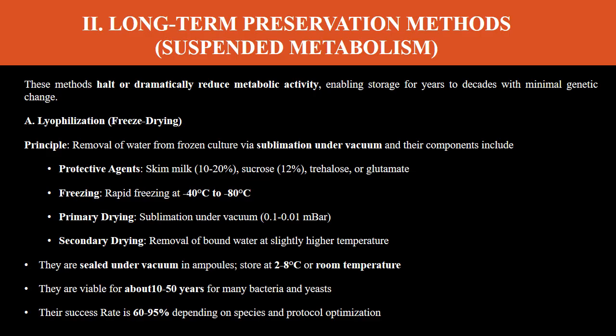They are sealed under vacuum in ampoules and stored at 2 to 8 degrees Celsius or at room temperature. They are viable for about 10 to 50 years for many bacteria and yeast. Their success rate is 60 to 95% depending on the species and protocol optimization.